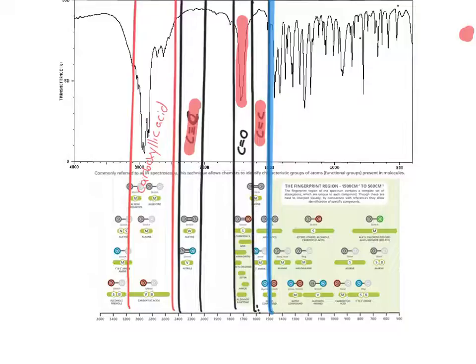The next region over is the carboxylic acid region. The reason why this peak is so wide is due to the presence of an alcohol that is capable of hydrogen bonding. Since we know that ibuprofen has a carboxylic acid present in the molecule, this peak here is representative of that.